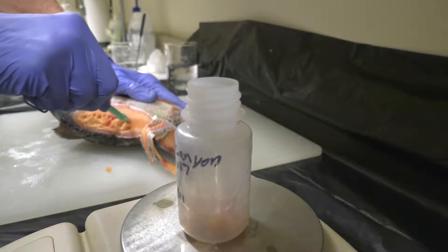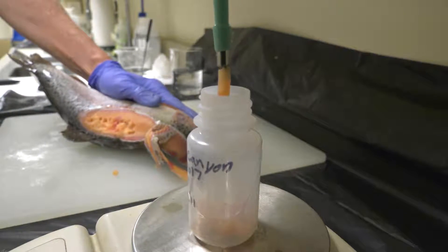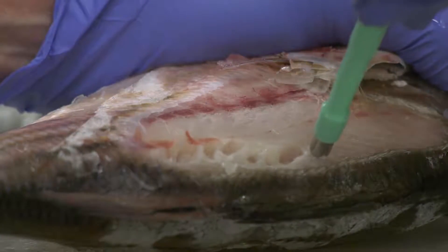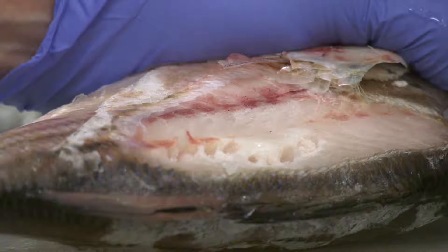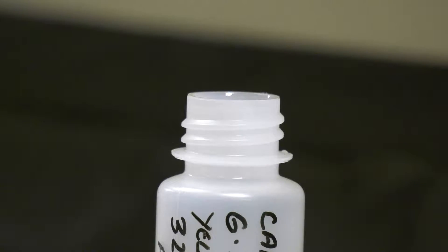We definitely look to see if the fish is in good condition. We don't want fish that are skinny, and we also don't want fish that are too fat — we want fish that are in normal condition. We go ahead and sub-sample the fish by punching into the fillet portion and putting the sample in the container.